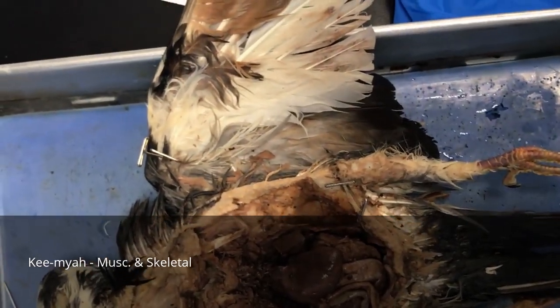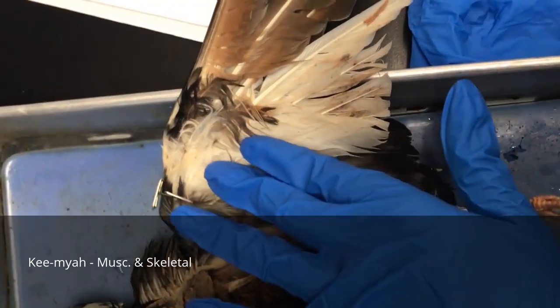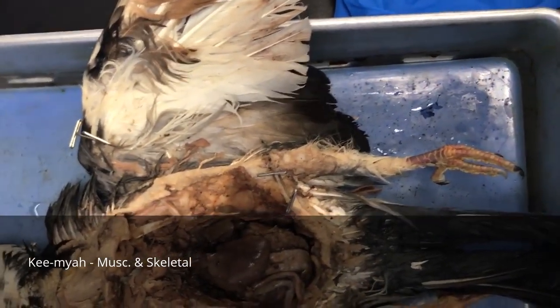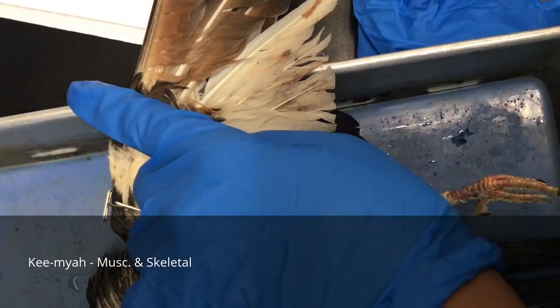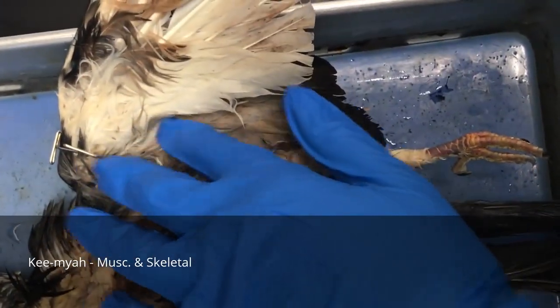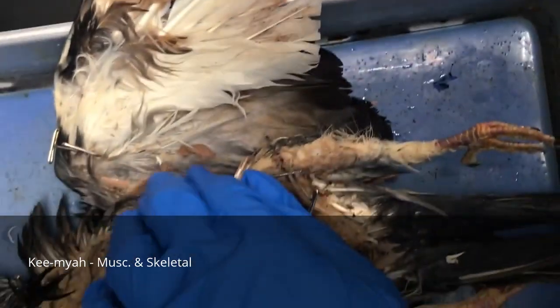So for the pigeons, the pectoral muscles and the muscles in the wing are more developed to help with flight. So with this, we have the interosseous palmaris here, and the inner part of the wing, can't really see it.